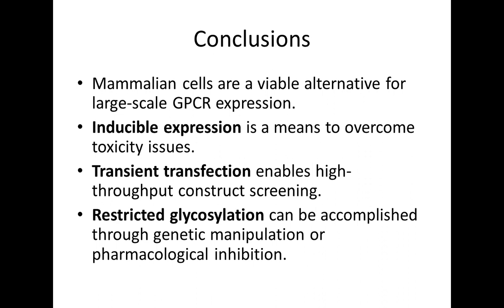Great, thank you. Are there any mutagenesis strategies for improving expression of GPCRs? That has actually been explored by a number of groups, and there are entire companies founded on those principles. Usually the strategy is to do random mutagenesis throughout the receptor, and then do high throughput screening to identify mutations that improve expression.